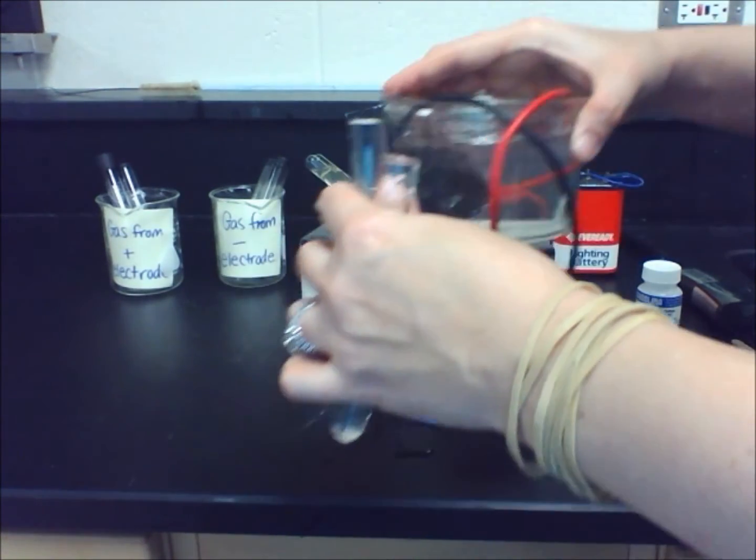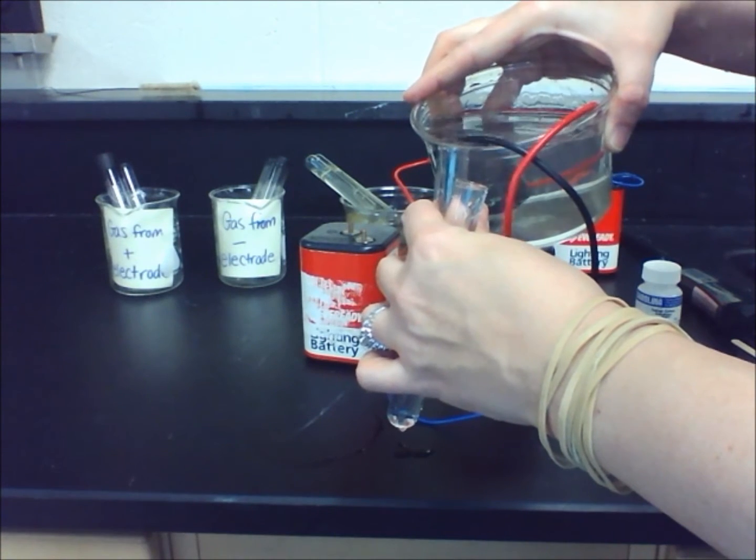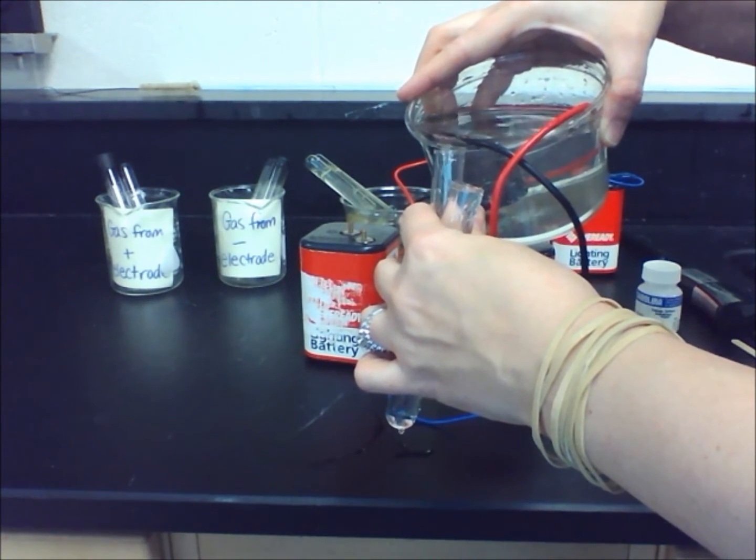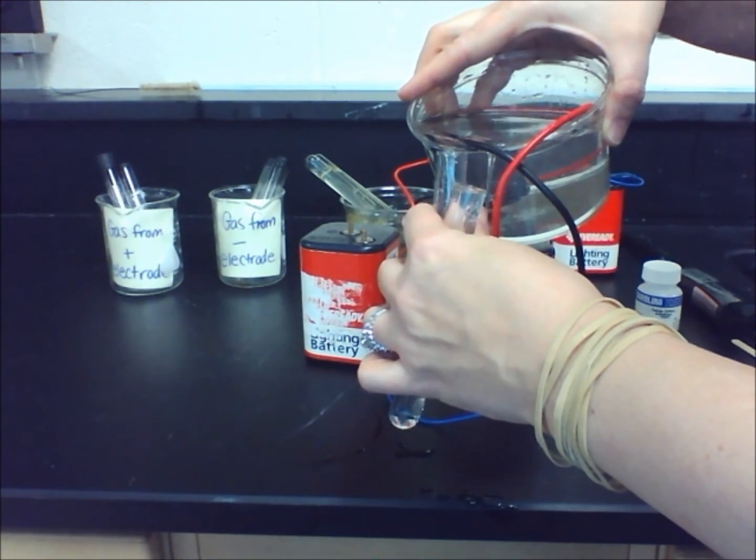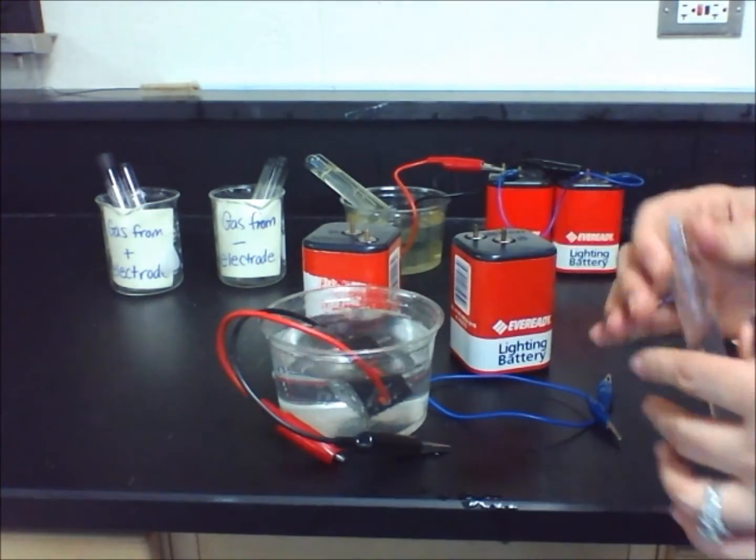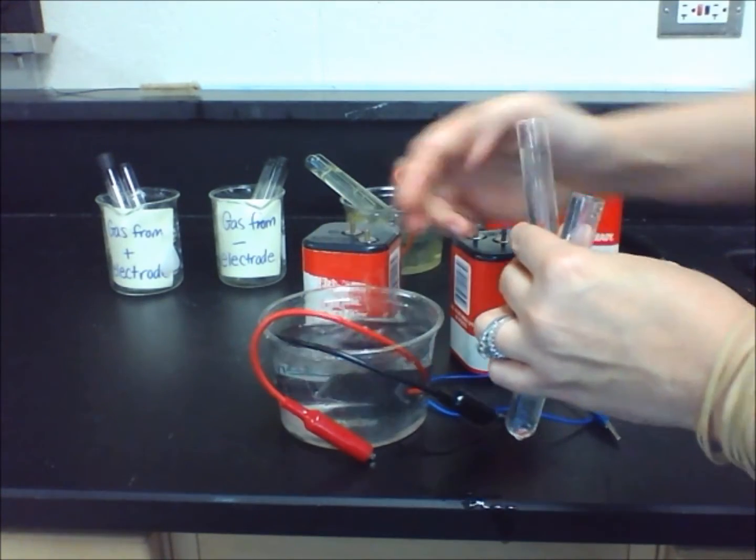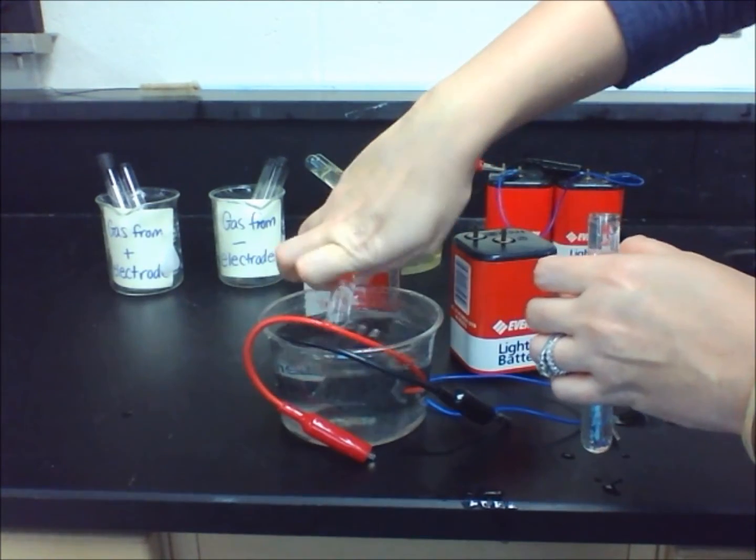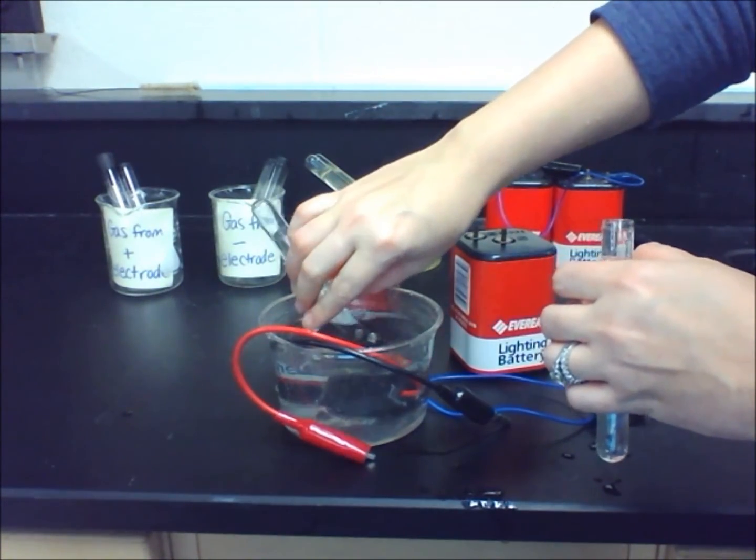Then, fill one of the test tubes with water from the sodium sulfate solution. Place your thumb over the top, making sure the open end of the tube is below the liquid, and place it over one of the electrodes. The tube must still be full of liquid. Repeat this with the other tube and placing it over the other electrode.